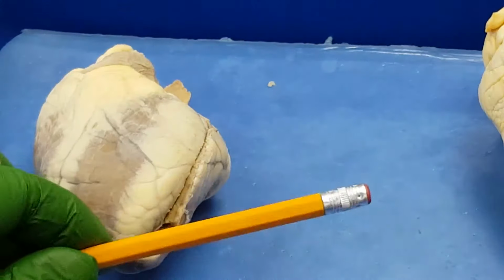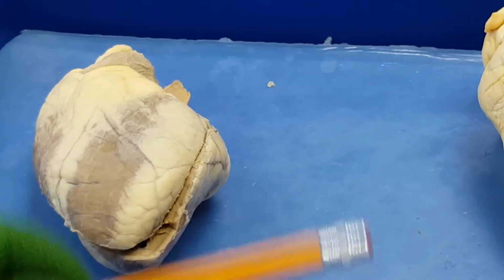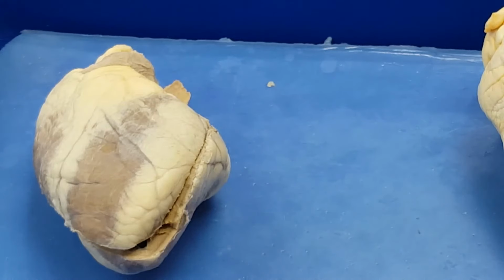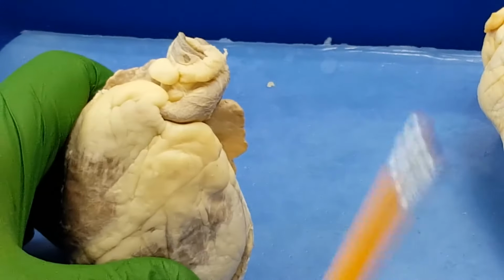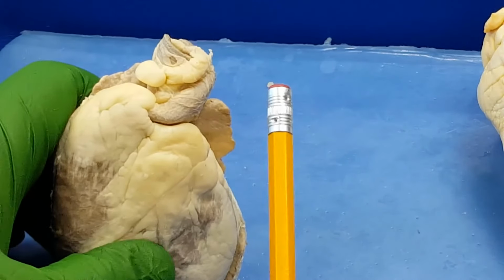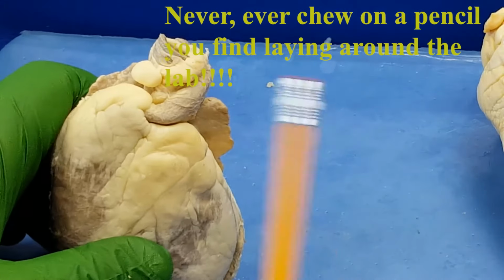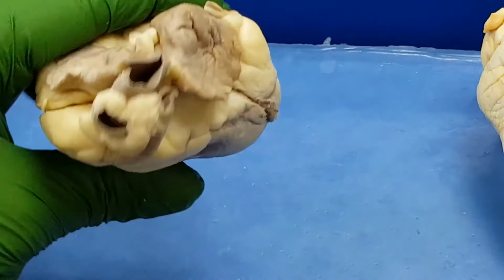I'm going to use a pencil for this. Why? Because I found a pencil here in the lab. Sometimes I use a pipe cleaner. Sometimes I use a metal probe. But today, I have a pencil, so I'm going to use a pencil. And then, of course, this pencil is going to go in the garbage after this, except for whatever photos and images I might take with it for your practice section.